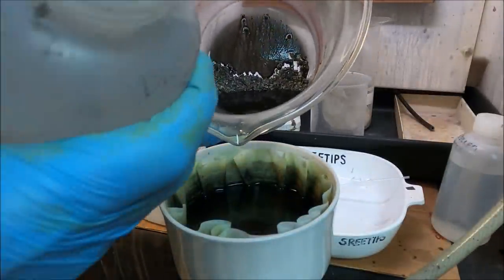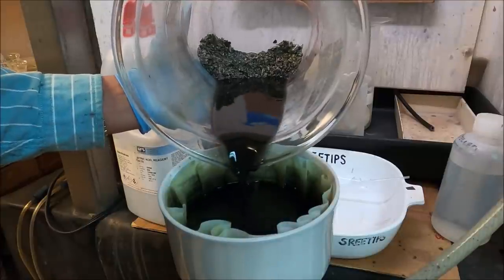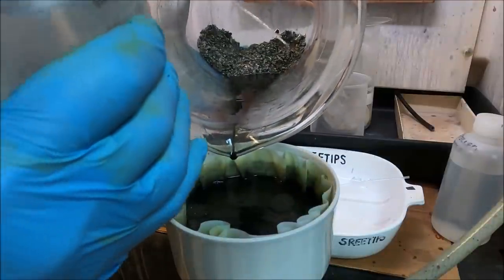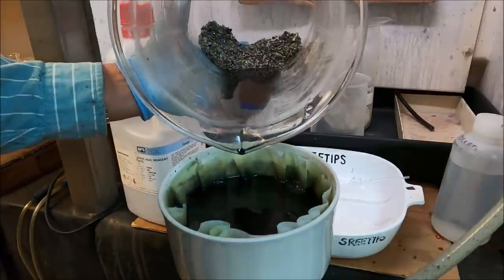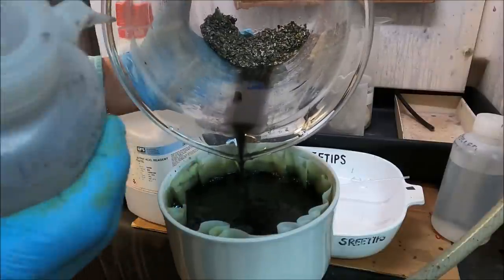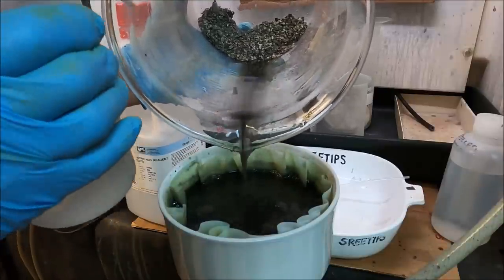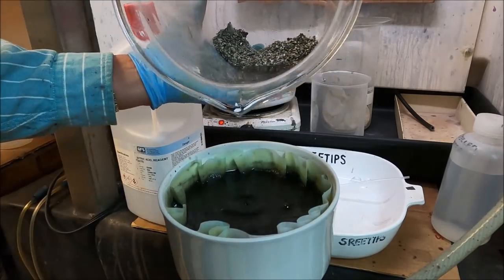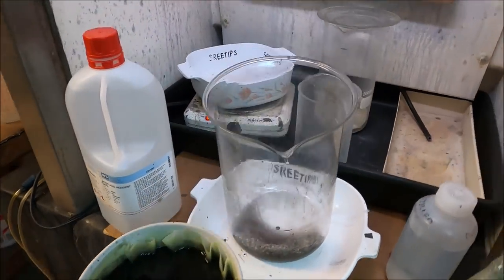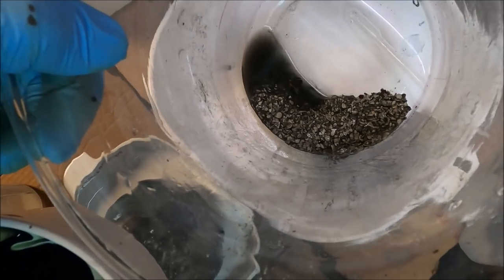Bottom of the beaker down there, you'll see a bunch of silver left as solids in the bottom of this beaker. So I'm going to get as much of the black powder out of there as I can. And then I'm going to... black powder is going to be precious metals, possibly platinum group metals, or gold. And I just want you to look in here, that's silver. That's the granules of silver I've got left in there.